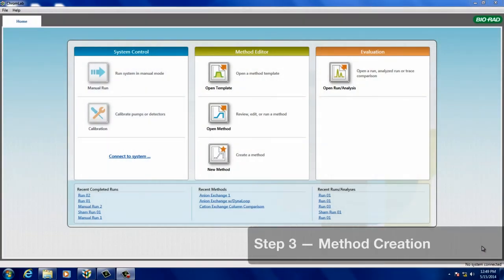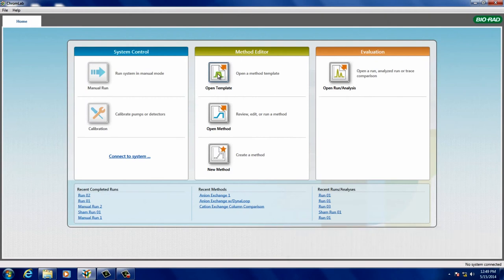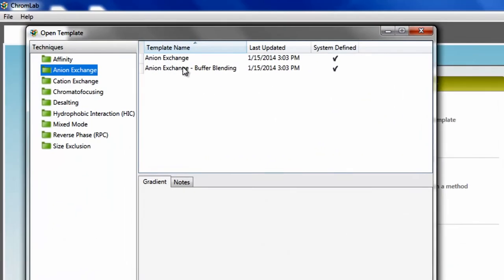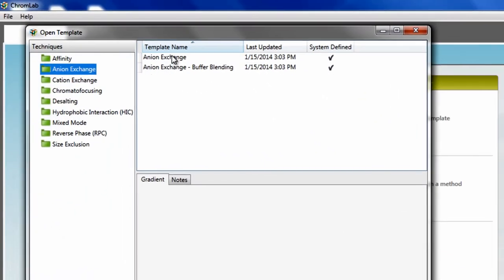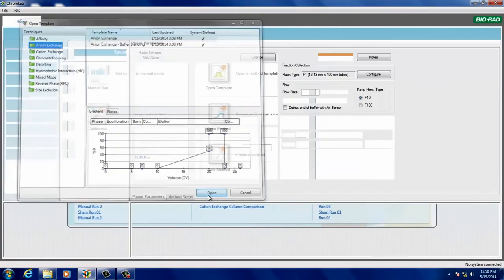Finally, you'll prepare your Dyna Loop method in ChromeLab. From the home screen, go to Open a method template. For this example, let's choose anion exchange.